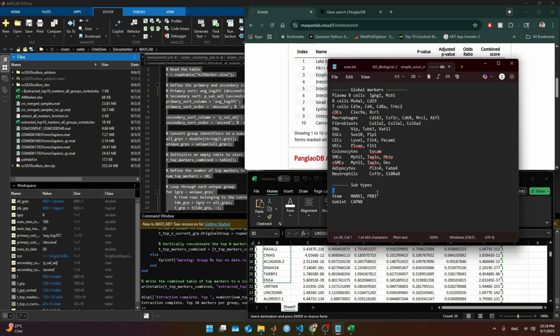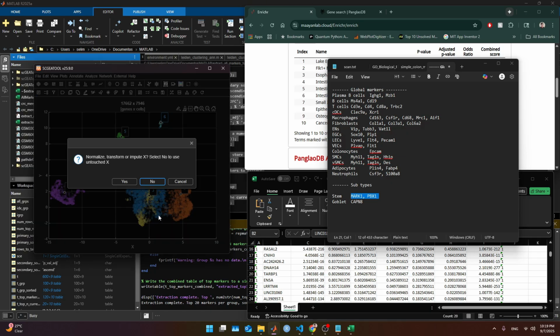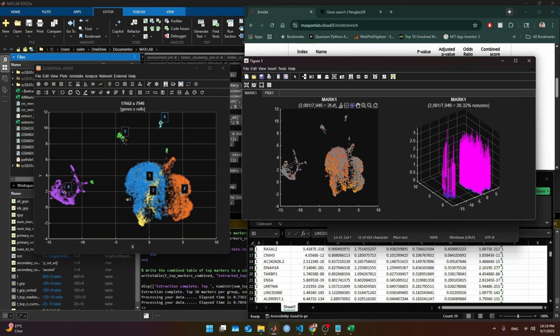PBX1. So what we can do is go to the tool again and look at the expression, paste. Okay, yeah, A and B, and I hope it only or mostly lights up in the number 1. And yeah, it potentially lights up in all this, which is exactly what I expected. These are colonocytes. But stem cells, I am not so sure all of them are stem cells, but mostly within the number 1. Okay.